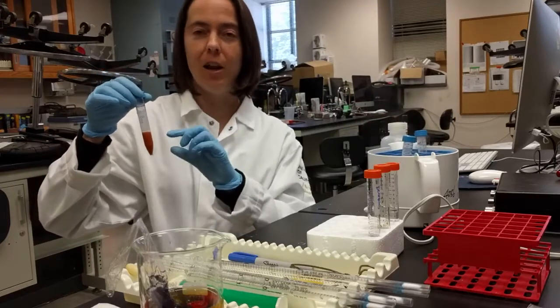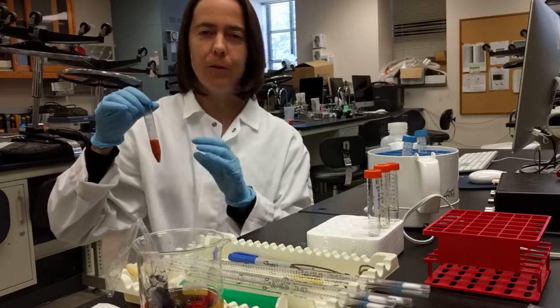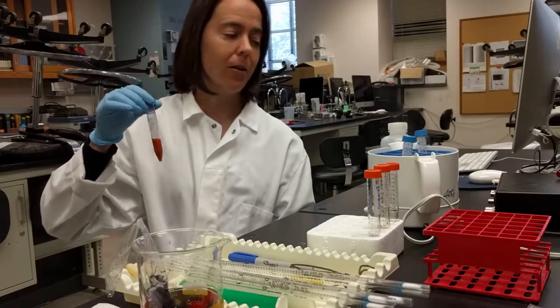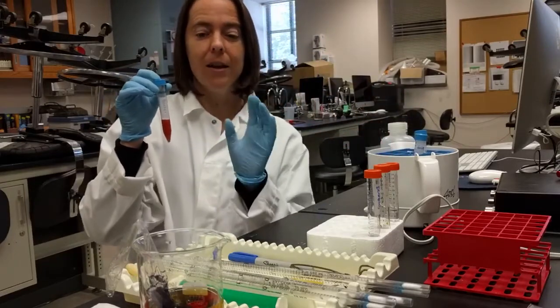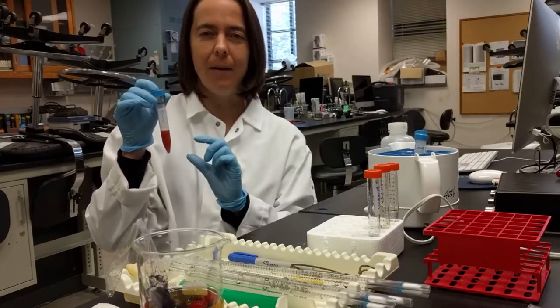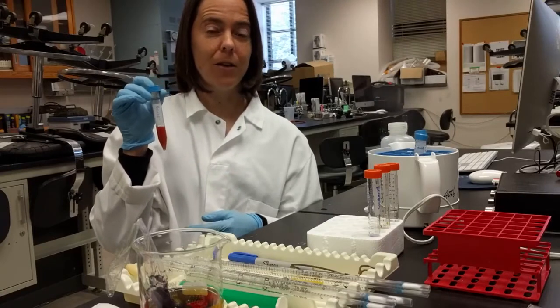Okay, so this solution has the liquid from the bag, the dialysis bag, plus Benedict's solution in it. This is after 5 minutes. Okay, so make note of that color. Okay, and then this is the solution from the beaker, right? So I took out the liquid from the beaker after it had done its diffusion. I added in Benedict's solution, and then this is the color that it turned. Okay, so make note of that.